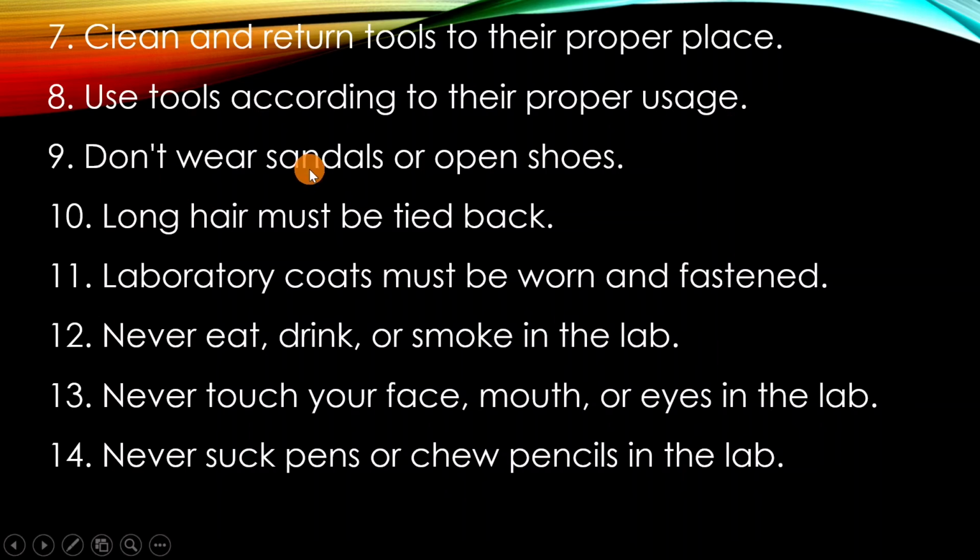Then use tools according to their proper usage. So you are not supposed to use an apparatus for a purpose it is not meant for. Use apparatus according to the purpose they are meant for.